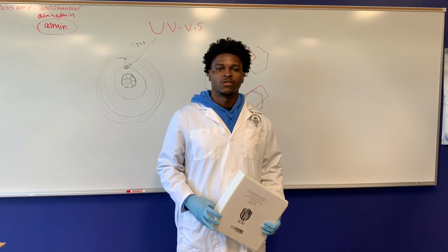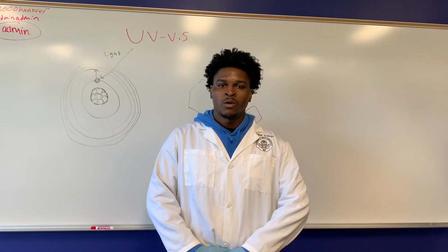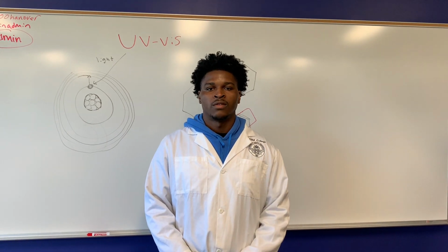Today I will teach you how to run the UV-Vis based on the lab manual. Before we run a test, you have to know a little bit of background knowledge on the UV-Vis and what it's actually testing.